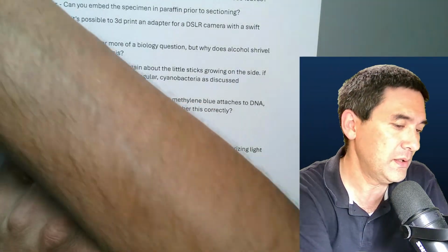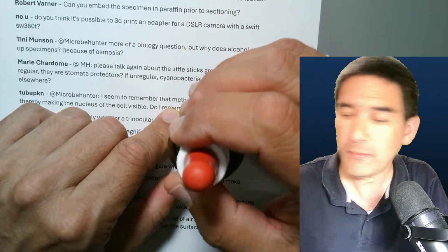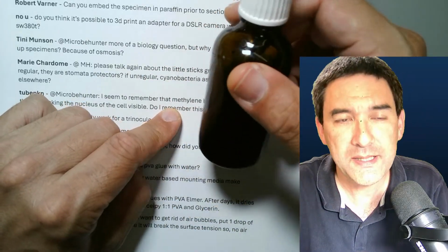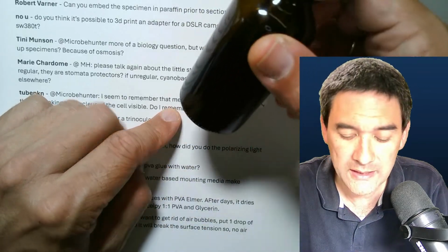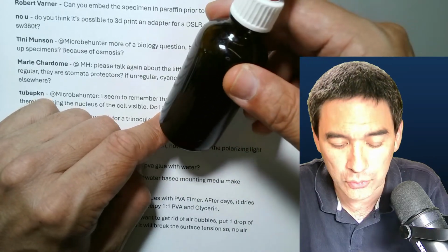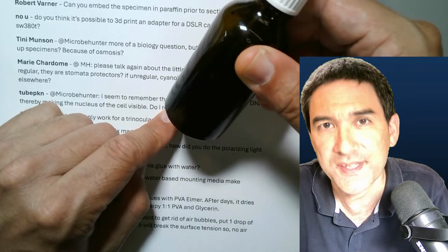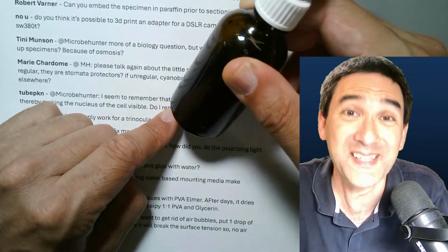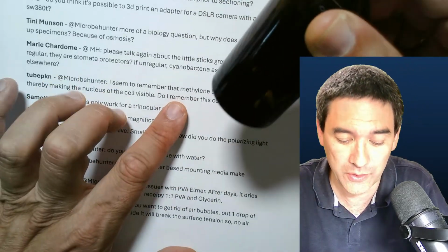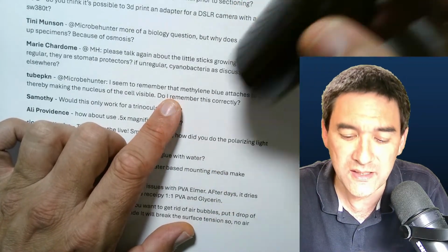Another thing, the methylene blue solution that I'm using here is called Löffler's solution. It's a ready-made mix. Löffler was a German biologist. This is not a concentrated methylene blue solution. It also contains alcohol, and a base, I think potassium hydroxide, if I remember correctly. Because it's alkaline, the stain likes to stain acidic parts of the cell. And what's one acidic part of a cell? That's the DNA, because DNA is an acid, deoxyribonucleic acid. So bases like to stain acids. That's one of the reasons. Methylene blue itself is also slightly basic, but the solution is as well. That's why it stains the nuclei especially well.